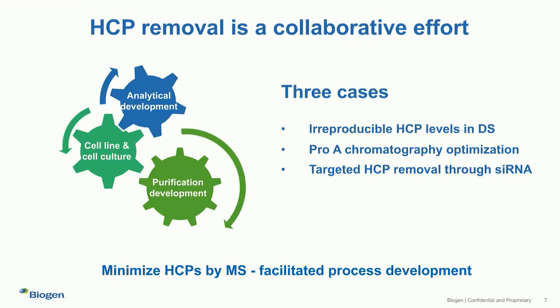So in Biogen, analytical development has a very good working relationship with the cell culture and purification folks. Together we solve the challenges associated with host cell protein. Below, I will show you 3 case studies which are the results of this type of collaboration.